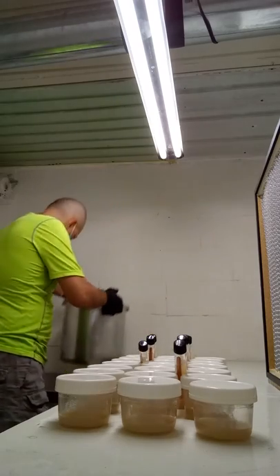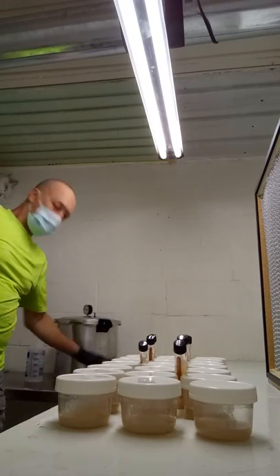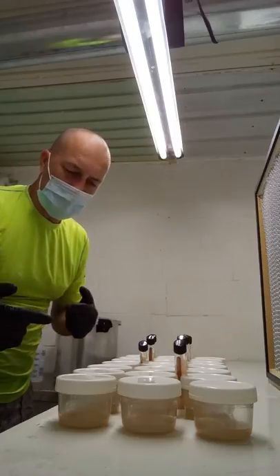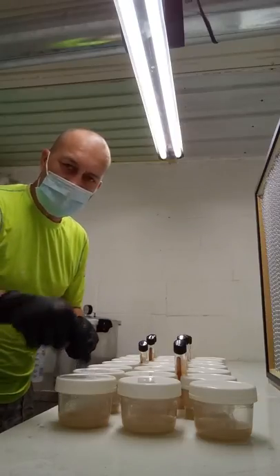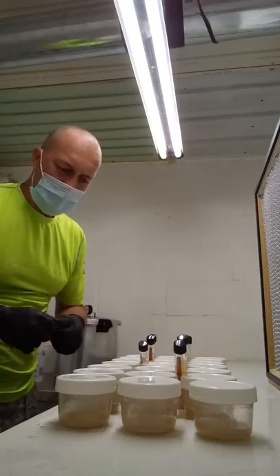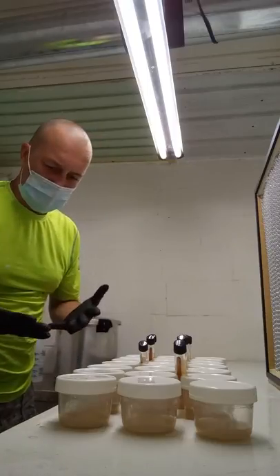Alright, so that's just a short quick video of how to use mason jars as petri dishes. The good thing about these — they're reusable and they're washable.